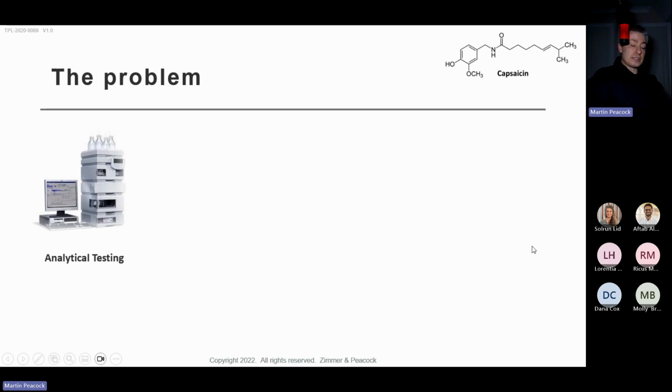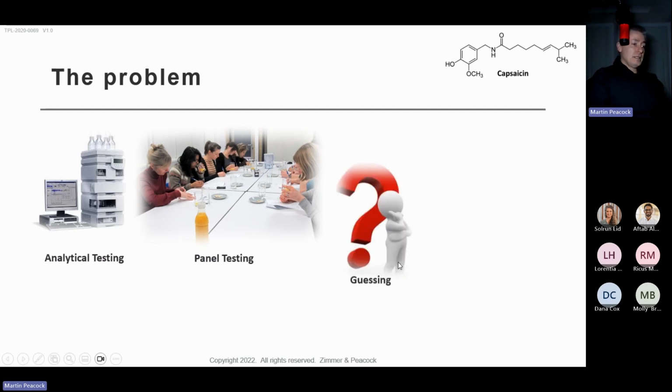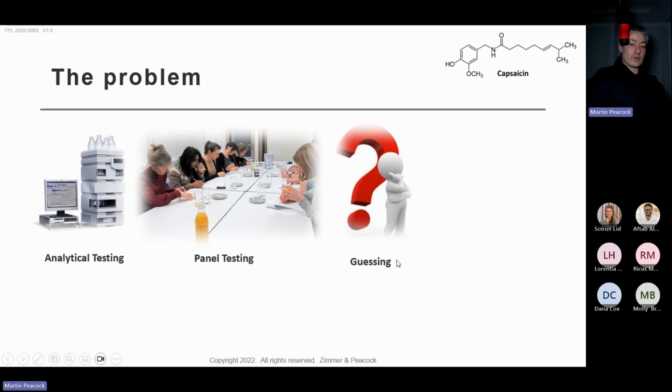The problem that we were originally setting out to solve was, as I mentioned at the beginning in the slides today, digitization and traceability. People weren't really doing that much testing when it came to the hotness of chili products. They would do occasional HPLC testing, but it's super expensive and doesn't happen very often. Panel testing, nobody does this kind of Scoville panel, which is an organoleptic test. You get a bunch of people and they all taste, and when you finish diluting, they can't taste it anymore, then you can score it, but nobody really does it. Guessing, I think, happens quite a lot.